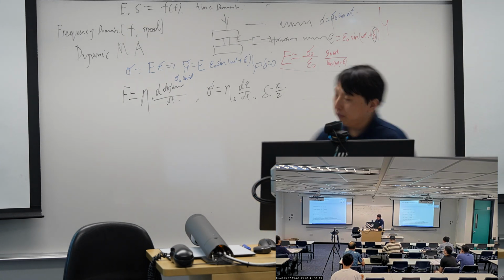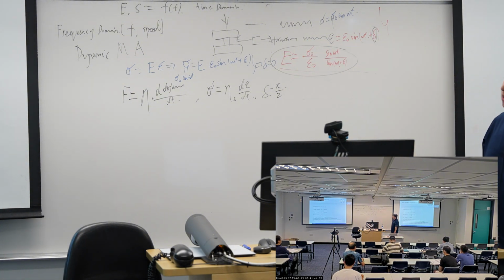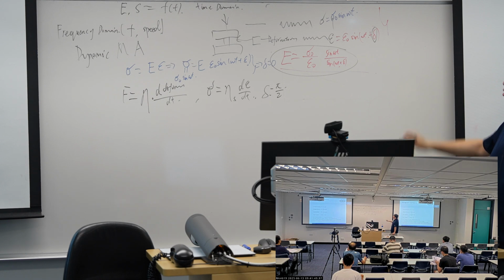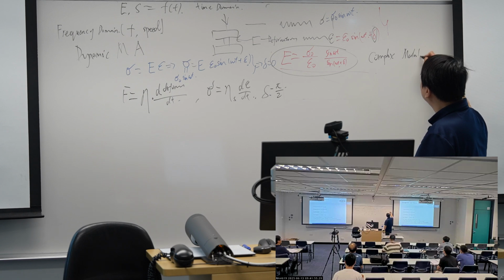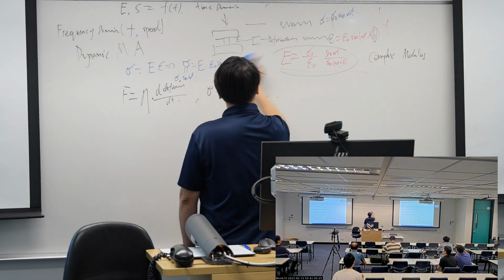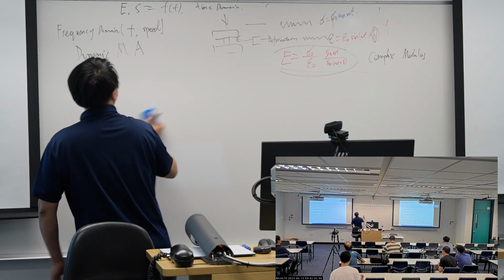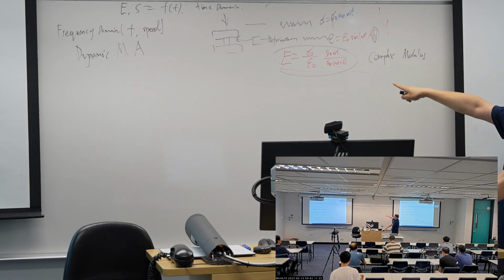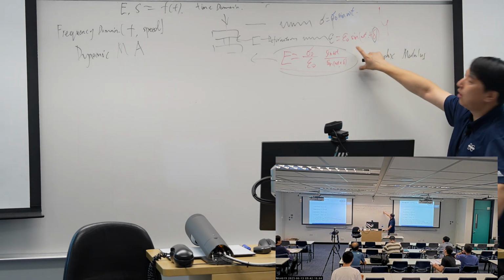So for this kind of modulus measured dynamically, nowadays they call this the complex modulus. The idea of introducing the complex number here is just due to the difficulty of solving this equation.